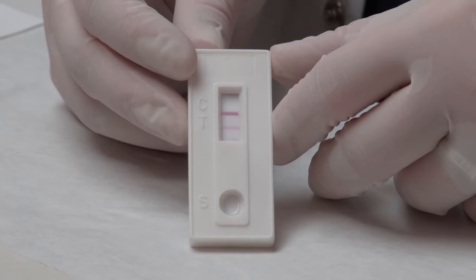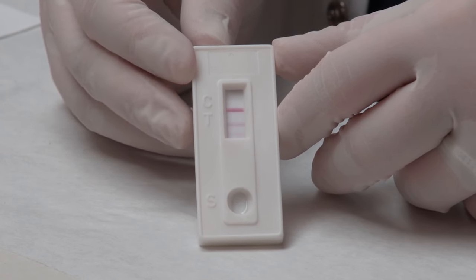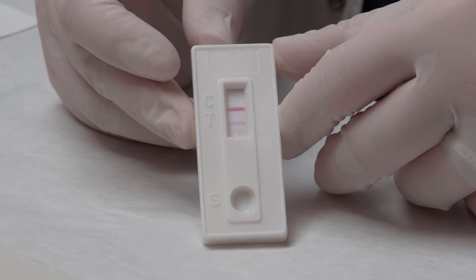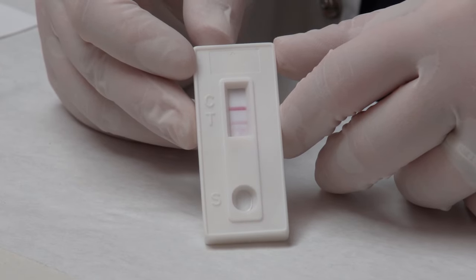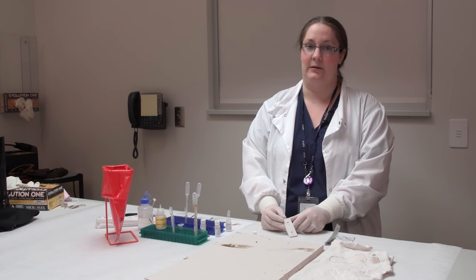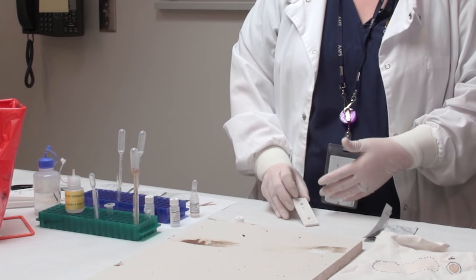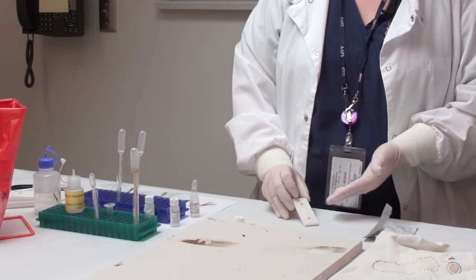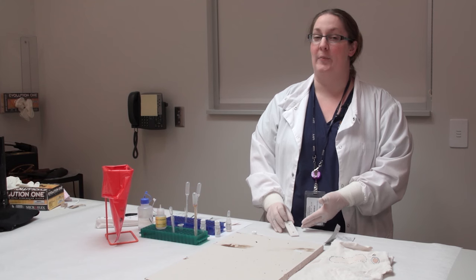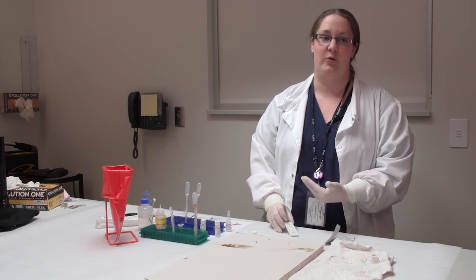This card has only run for about a minute and we can already see that there are two lines. The control line is on top, which means the test is working, and the test line is the bottom line - that's whether it's positive or negative. We do not need to wait the whole 10 minutes since we're already seeing a positive reaction. Once we see this positive, we'll take a picture of it and document in our notes that it was positive. Unfortunately, if you let these sit much past about half an hour, you might get a false positive, so we don't actually keep these as evidence - but we will take a picture or have it in our notes.